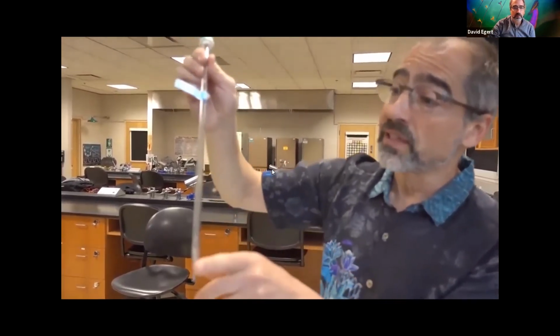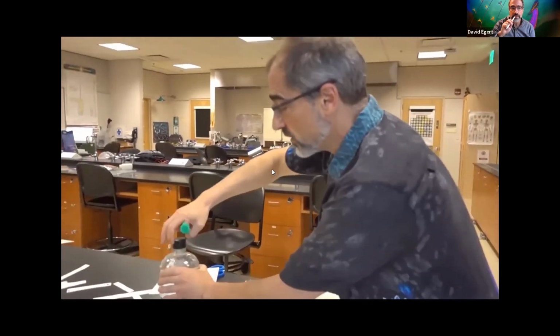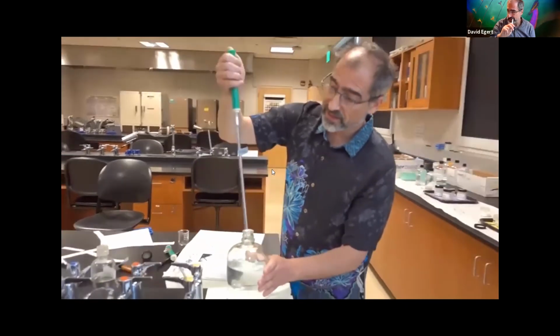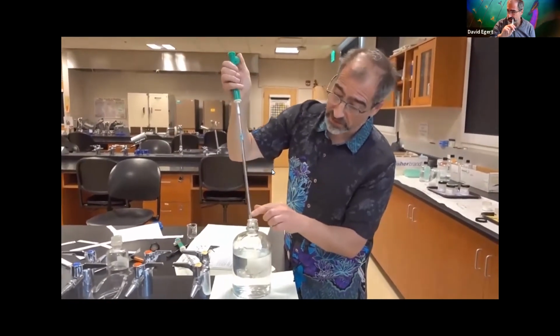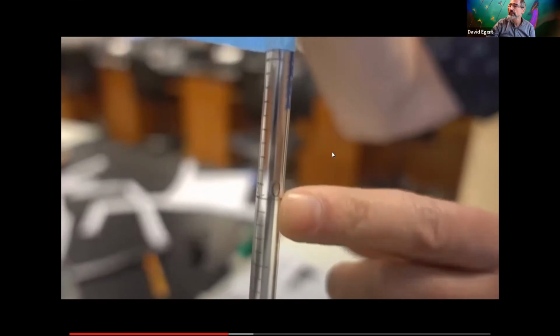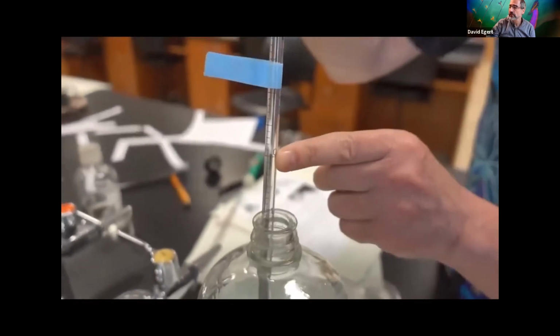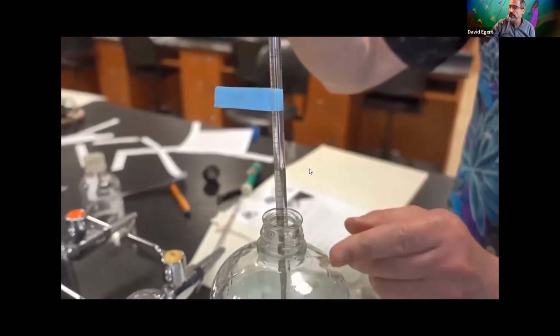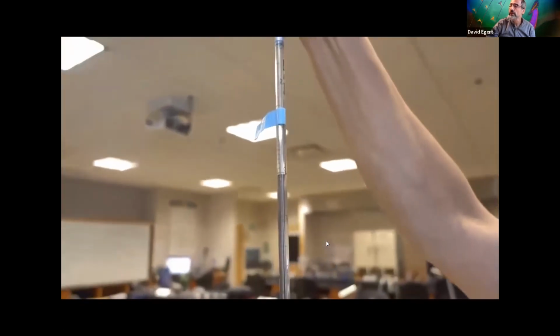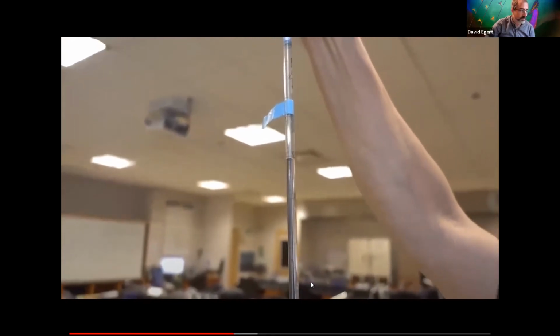The way it works is you put it in the liquid you're trying to pipette, and the numbers actually go upside down. They start at 4 at the bottom, then 3, 2, 1, and 0 is up here. So the technique you would use is you suck up until you are at the 0. And that means now there is 5 mils in the pipette.